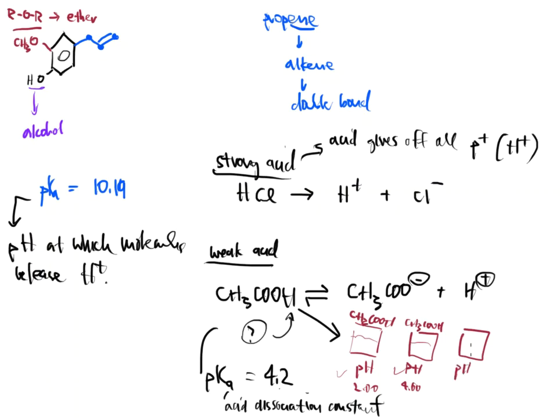And let's say that in my third container, my pH now is an 8. I increase the pH, which basically means I've made it more basic, right? pH over 7 is a base. The molecule realizes that now. And the molecule says, oh, whoa, wait a minute here. You're putting me into an environment that's a base, and I'm an acid because I have a pKa value, and I'm basically telling you what pH I will give off my hydrogen. And in this case, my pKa is lower than the pH of the solution.